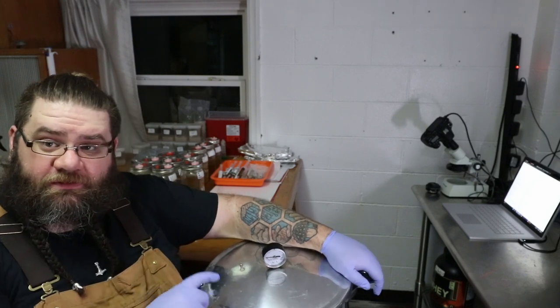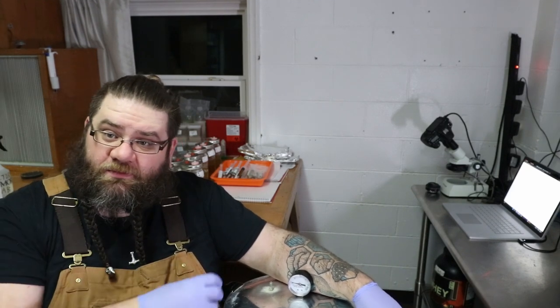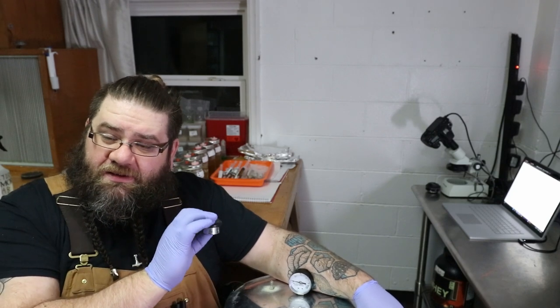These Prestos, whereas if I took the pot out of my All-American, I could fit somewhere between 4 and 6 5-pound bags of grain spawn in there. I can usually only fit 4 in here. And I really have to pack it full of water to make it last the 2.5 hour run. Even with this weight barely hissing, that's what you want with these things. It's just the weight barely hissing.